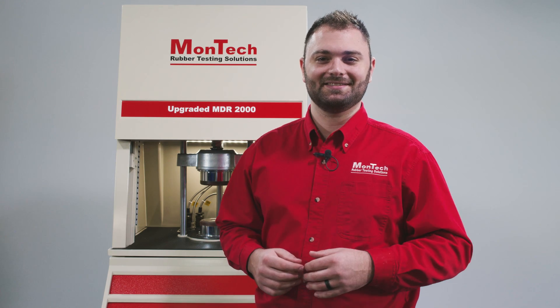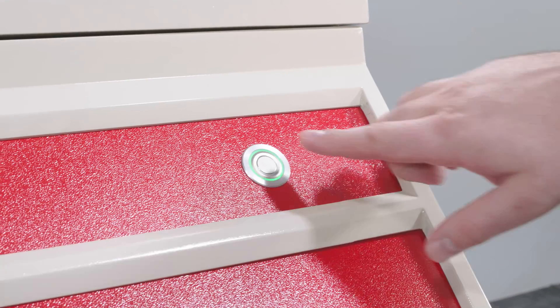Running a test is easy. Simply cue the test, load the compound and press the start button.